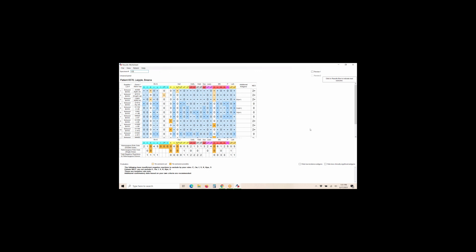And we're going to save it, but before we do save it, we do have some information here that we can look at now. And it's a little bit more complicated. So what we're going to do is go column by column. And again, if you guys have any questions, we can go over it.